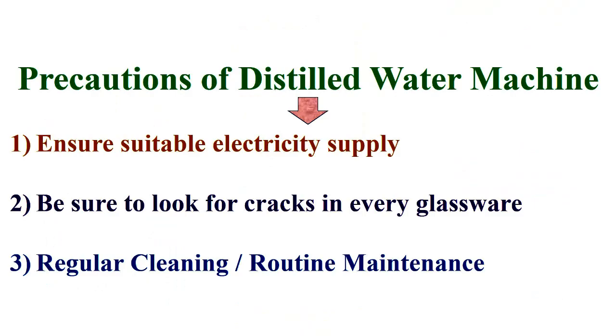When working with a distilled water machine, you must ensure a suitable electricity supply, be sure to look for cracks in every piece of glassware, and carry out regular cleaning and routine maintenance processes.